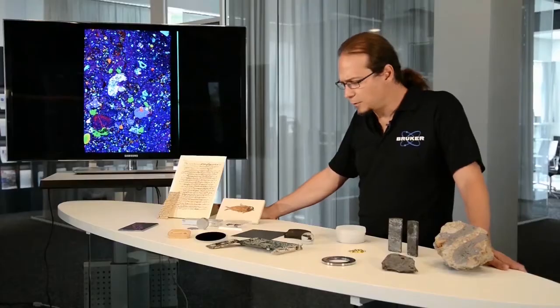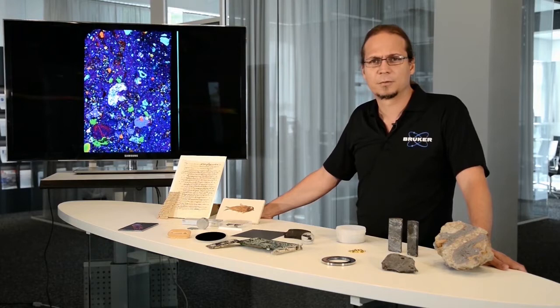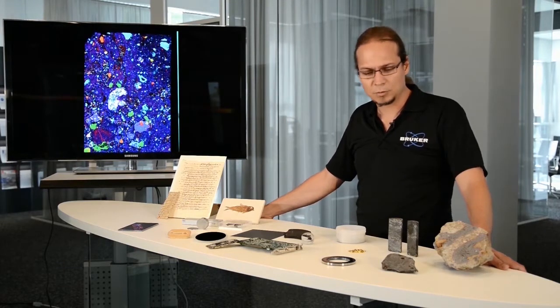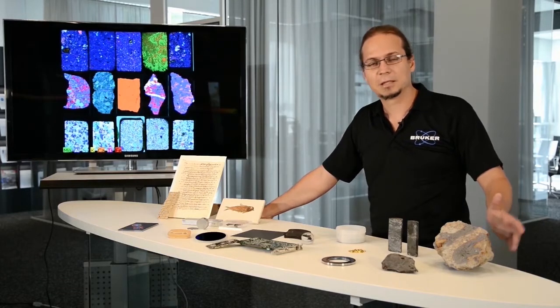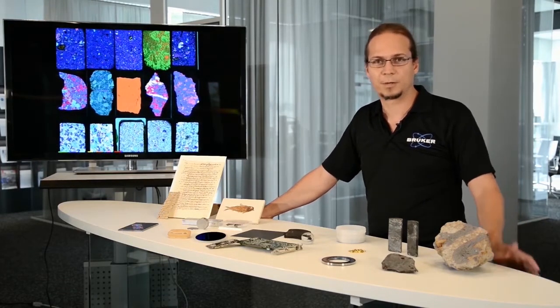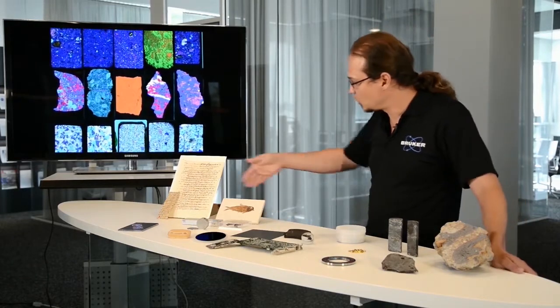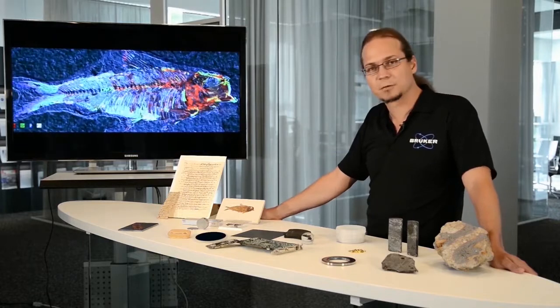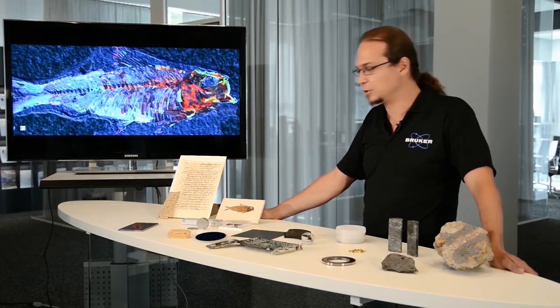Another of the important things to point out for Micro-XRF is the non-destructive approach for sample analysis, which means we can just place the sample as they are into the machine and get information about the element distribution without requiring any previous preparation. We can use, like in this case, a fossil fish and determine what are the elements in the fossilized material without doing any additional preparation to the sample.